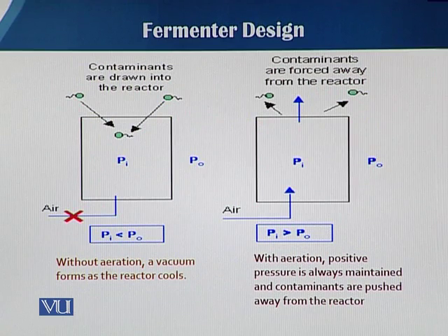In this slide, you can see the case of negative pressure inside, when there is no aeration, no oxygen supply or any other gas supply. So what happens?